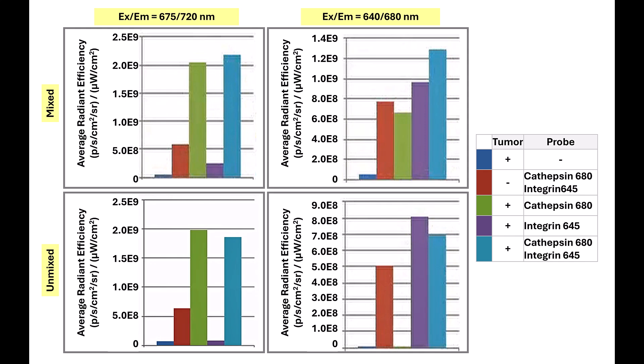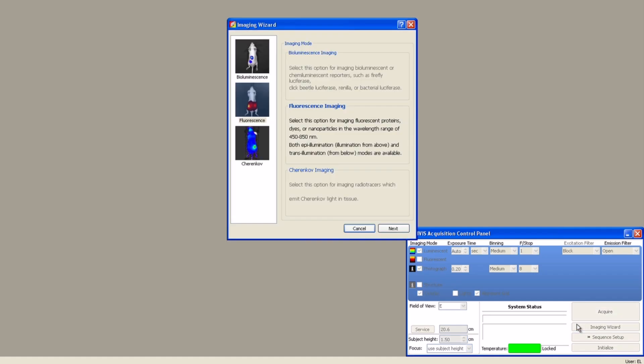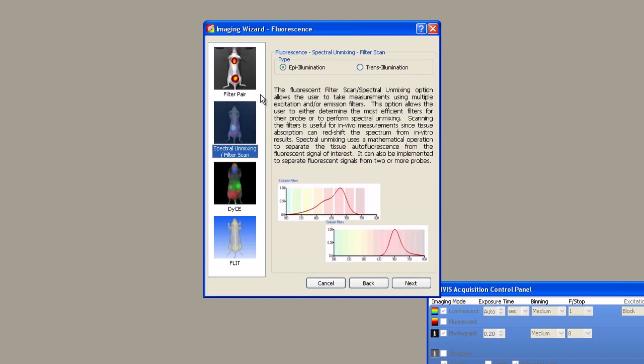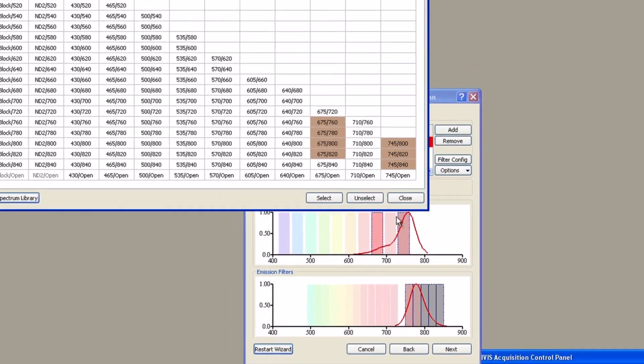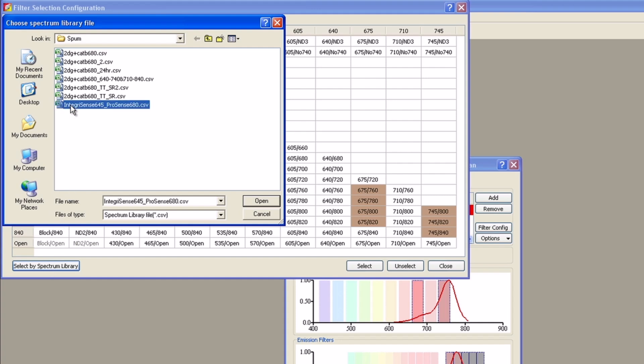Now that we have generated our library and tested the efficacy of our probes with a pilot study, we can proceed to a full-scale high throughput study. Libraries can also be applied to studies where the source is in different locations, for example a primary tumor or lung metastases. However, the studies must have the same basic design: same probes, same mouse strain, and same filter combinations. Now let's go through how you would unmix new images using a pre-saved library. Select the imaging wizard, fluorescence, spectral unmixing, and epi illumination. Click next, click filter configuration, and then select by spectrum library. Choose your library and click open. This will automatically load the filter selections from the previously generated library.